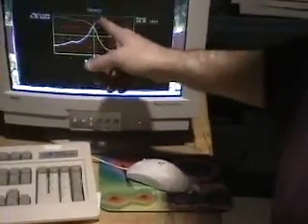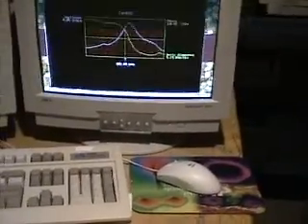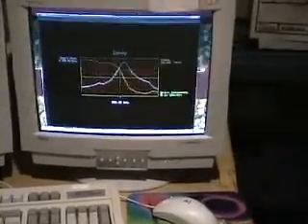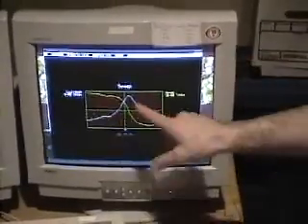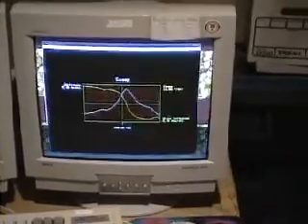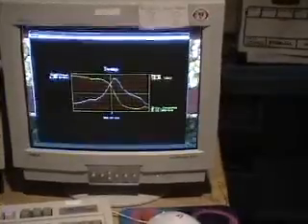It is important that if you're going to err on this, you want to err too far to the left of it and not on the side of getting too close to the peak, because there are strange image artifacts that happen if you're too close to the peak. But the computer is basically set up to pick that frequency for you automatically. So if the curve looks roughly like this, then the frequency is correctly selected.